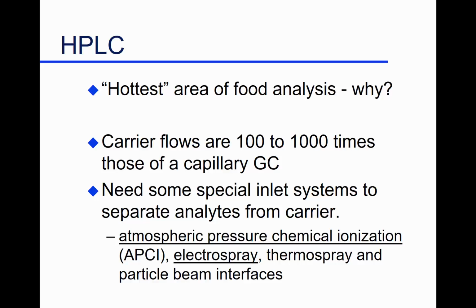The problem we run into, of course, is now we're not pumping a milliliter of gas. We're pumping a milliliter per minute of liquid into our system. And so we have a lot more mass we're pumping in that would turn into a tremendous volume if we simply put it into the system. And so we have to have some kind of special inlet system to separate your analytes from what I call a carrier, or if you want to call it the mobile phase.